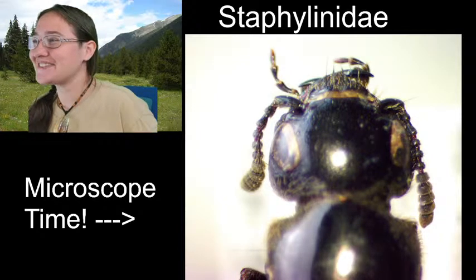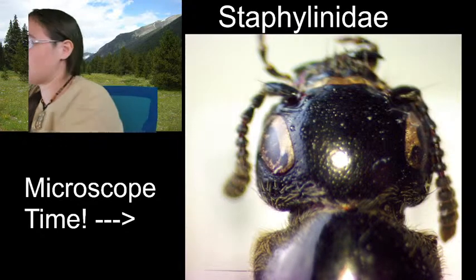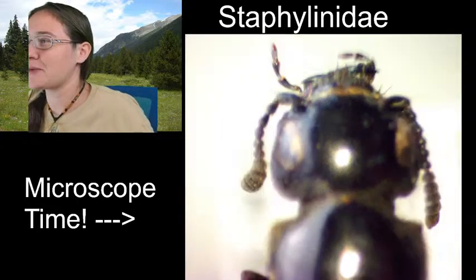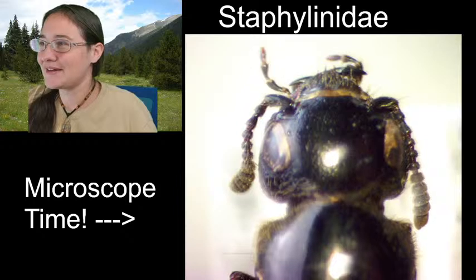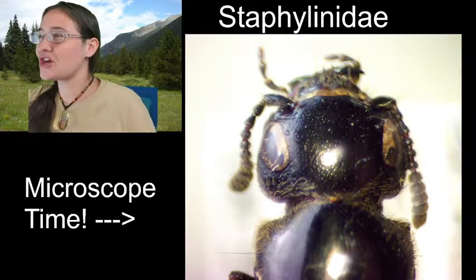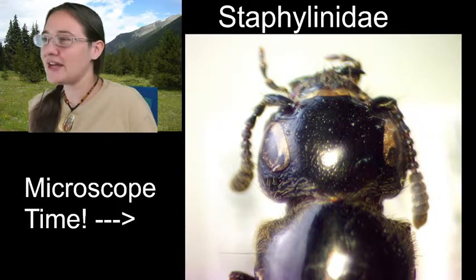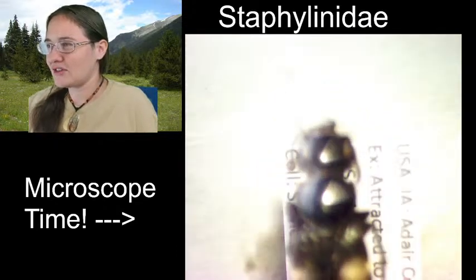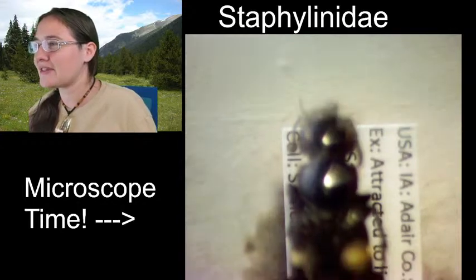Alright, so we've got all of that taken care of. Good. I think that's pretty well in focus for what we need to see right now. Maybe we can get in a little bit closer. I like it just like that. So, we're going to go ahead and sketch our head. And I'm going to zoom out just really quick because I want to see the comparison between the head and the elytra really quick.